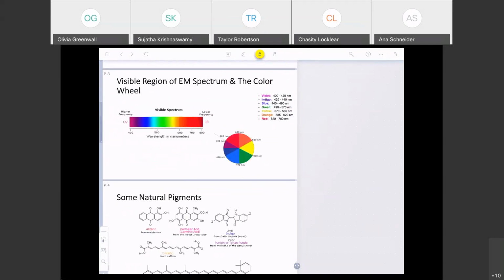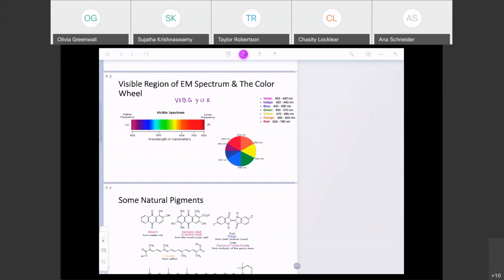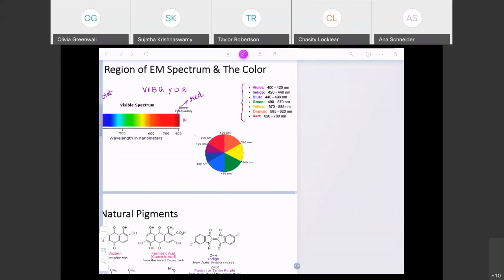The next slide is also very useful for today's lab. This shows the visible spectrum, which is made up of 6 colors, but Newton believed in numerology, so he introduced a 7th color, indigo. But it's violet to red, violet higher in energy compared to red. So here is your violet, so very close to the ultraviolet, and here's your red, very close to infrared. Okay. Now the actual numbers are here. You do not have to memorize, but we'd have to refer to these numbers today.